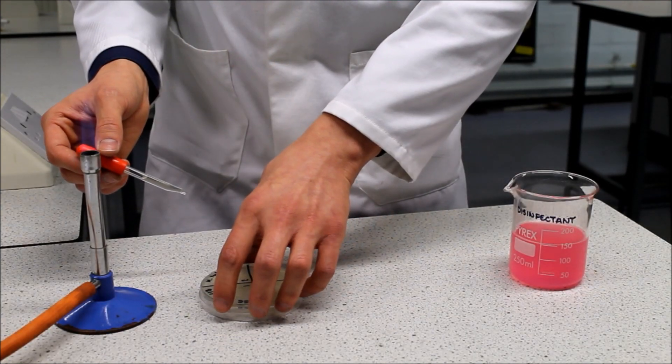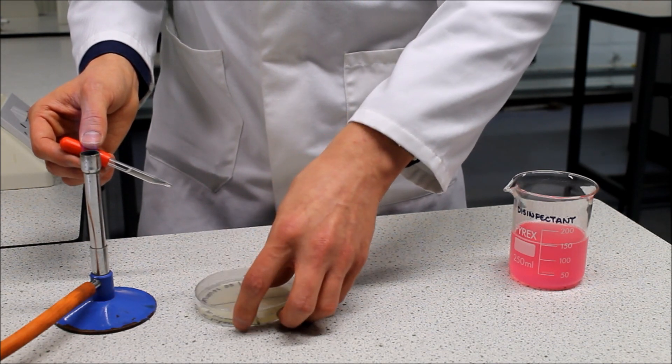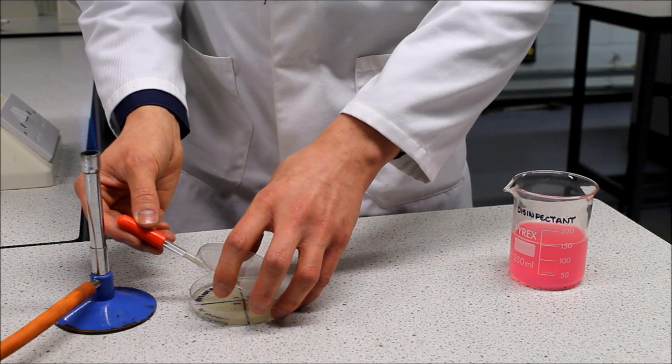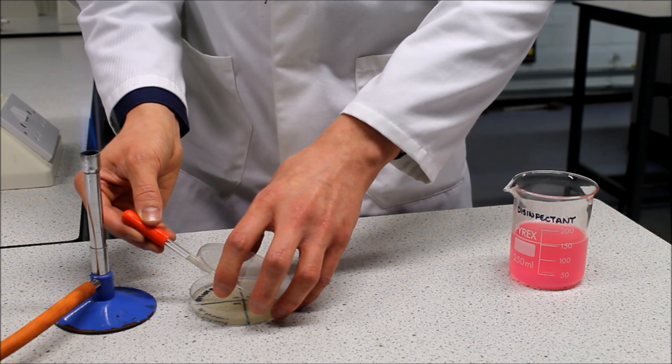Slightly lift the lid of the agar plate at the side nearest the Bunsen burner. Use the pipette to put two to five drops of culture, roughly the size of a five pence piece, onto the surface of the agar and replace the lid.